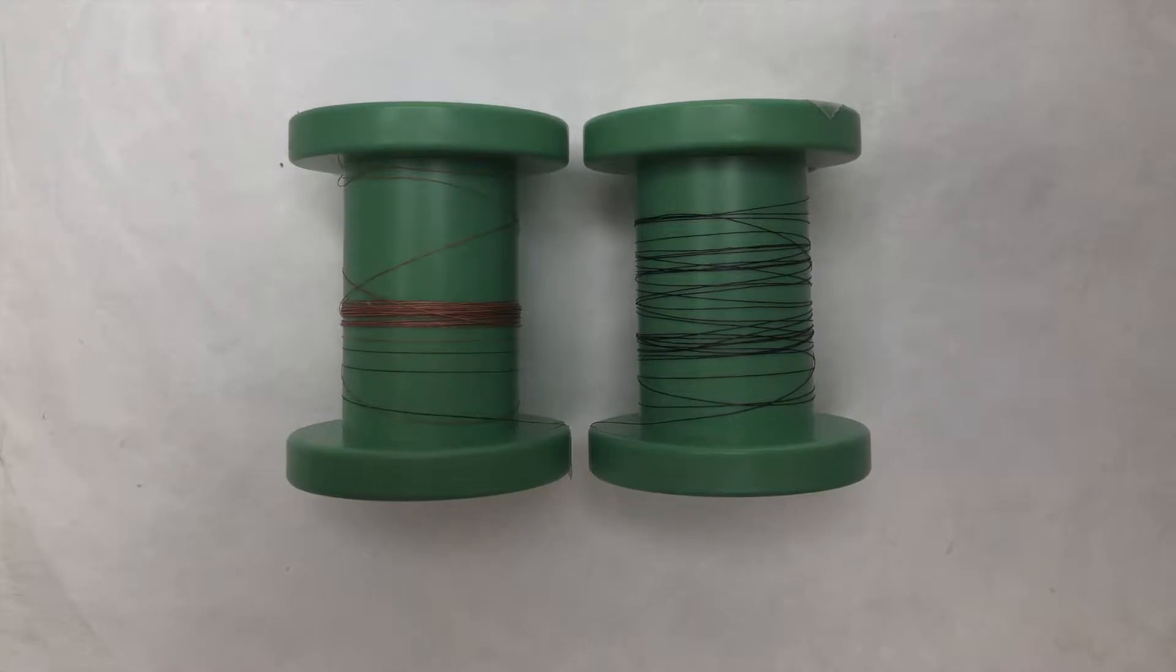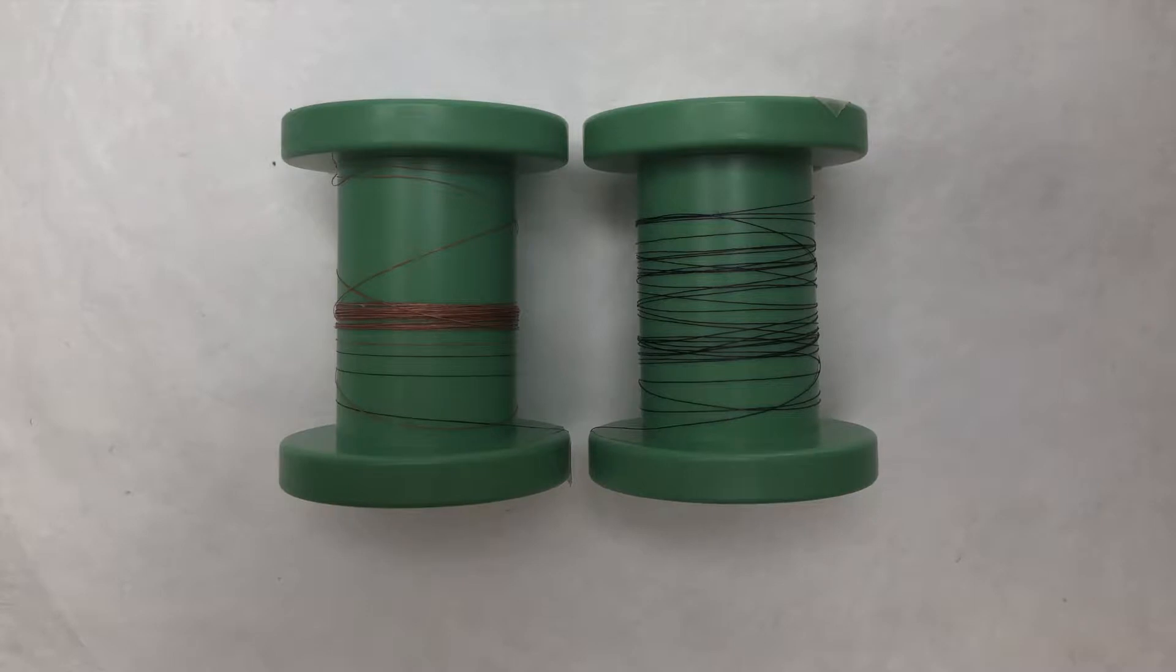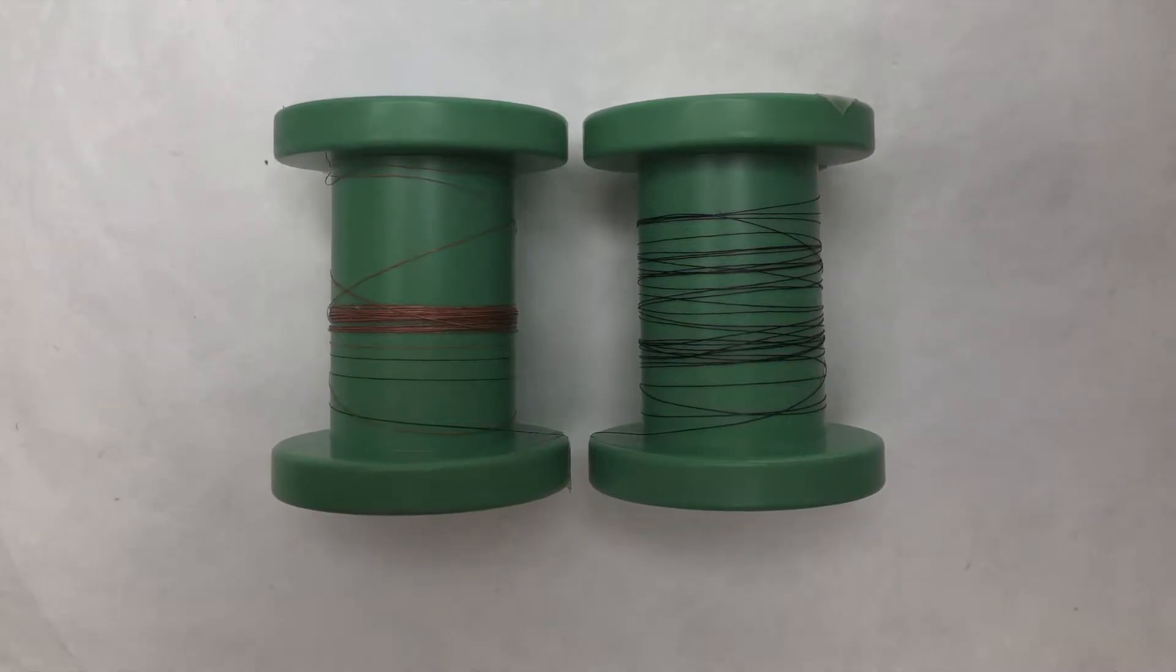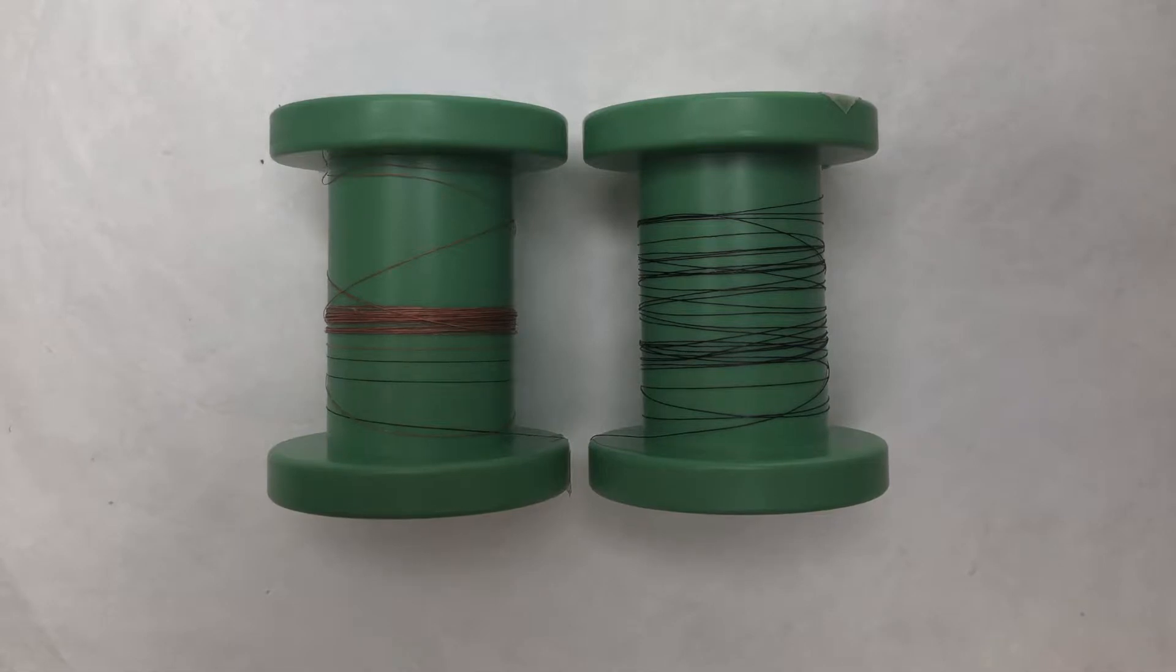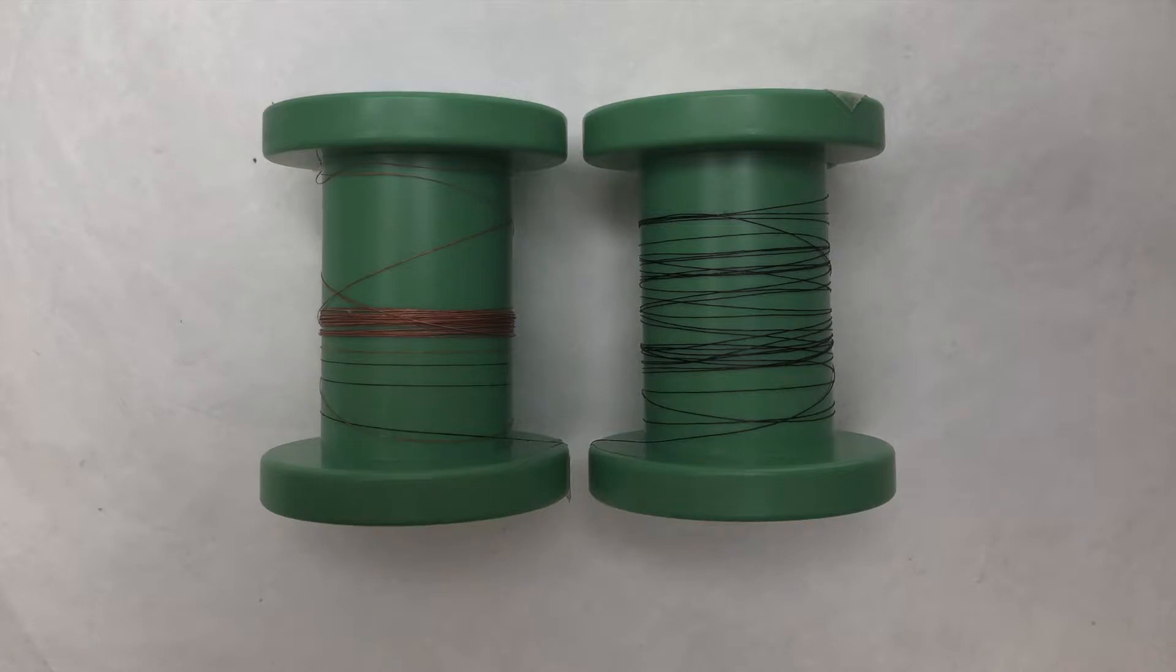So here you can see the spool on the right is our normal carbon nanotube yarn, and the spool on the left is the same carbon nanotube yarn coated in a layer of copper, which gives it that metallic orange color. Next I'll give you a quick look at the process that we use to apply this layer of metal onto the yarn.